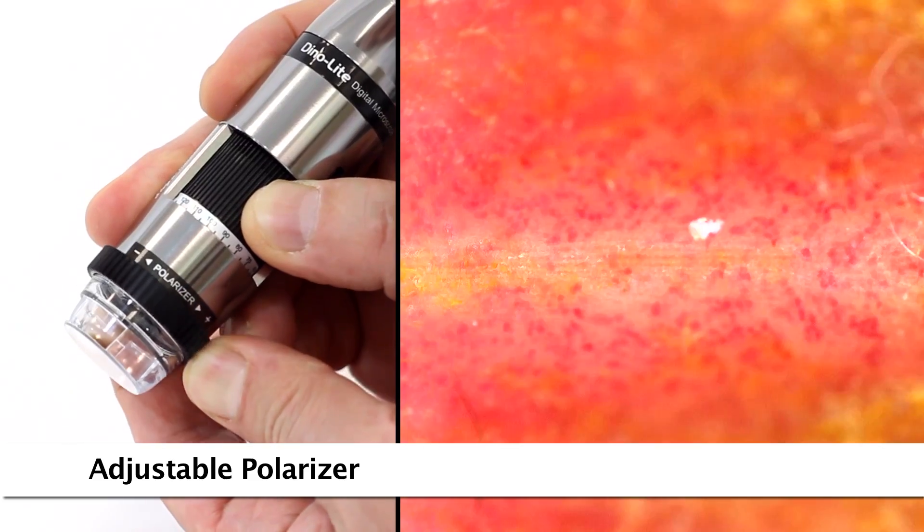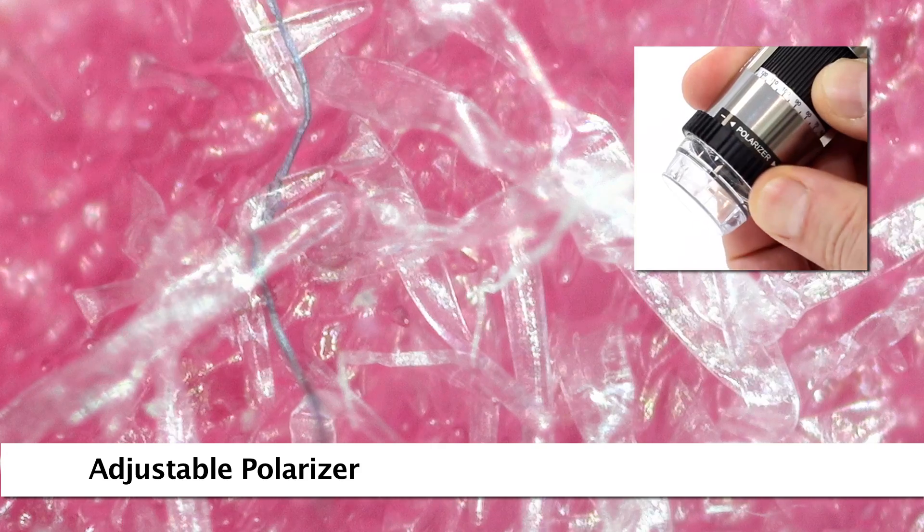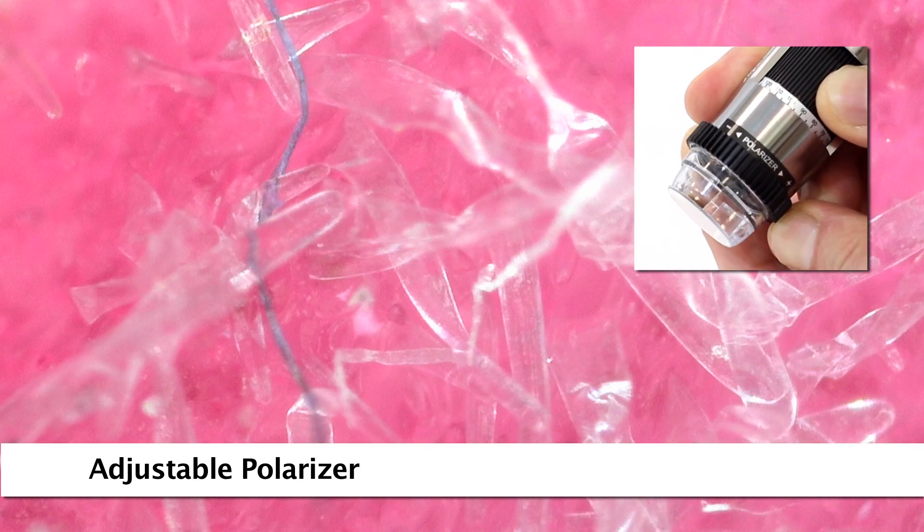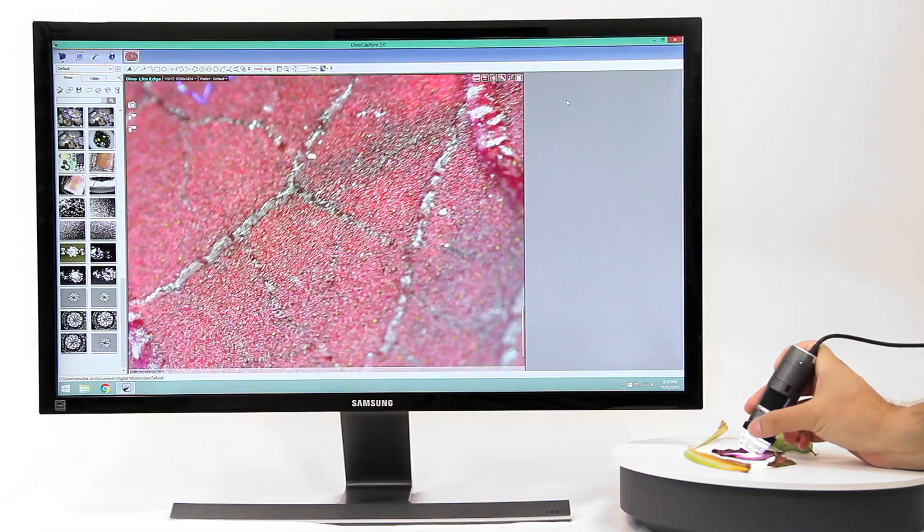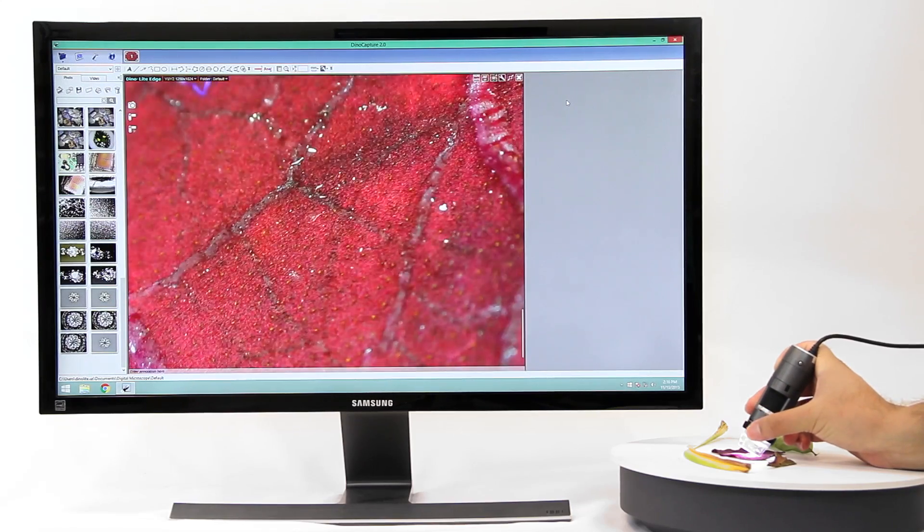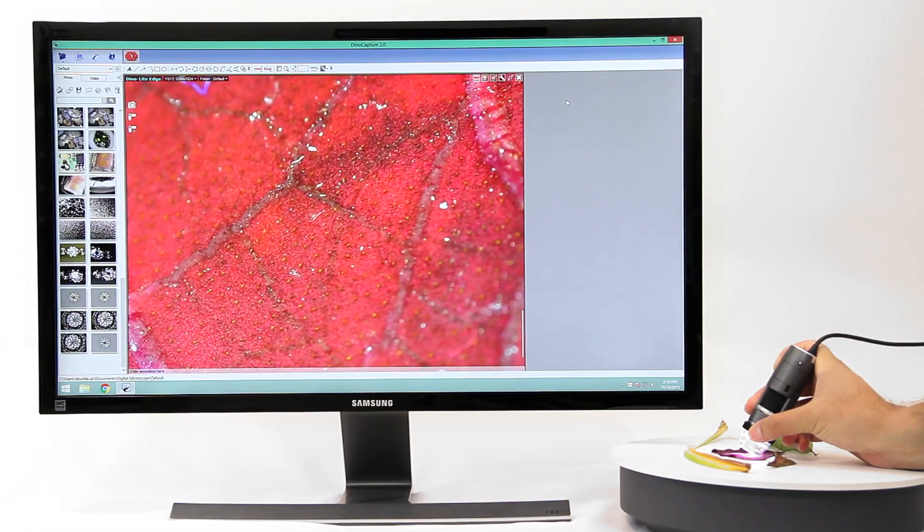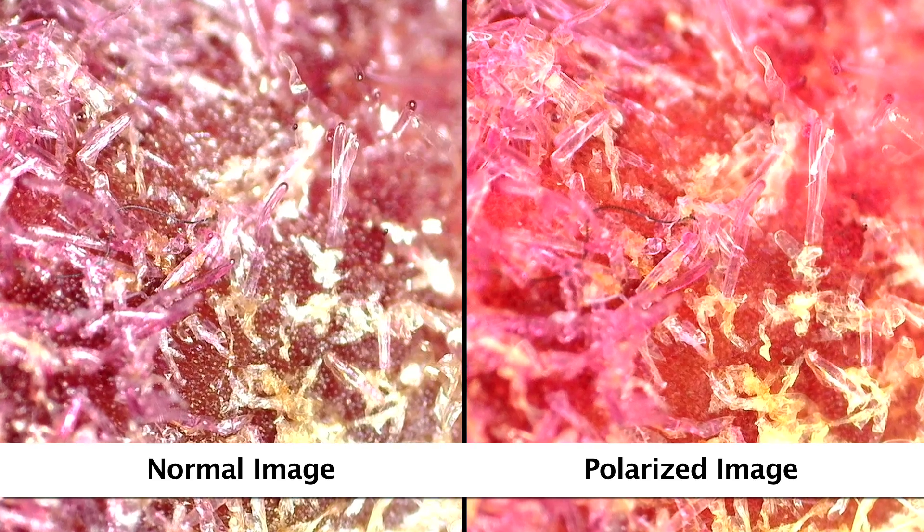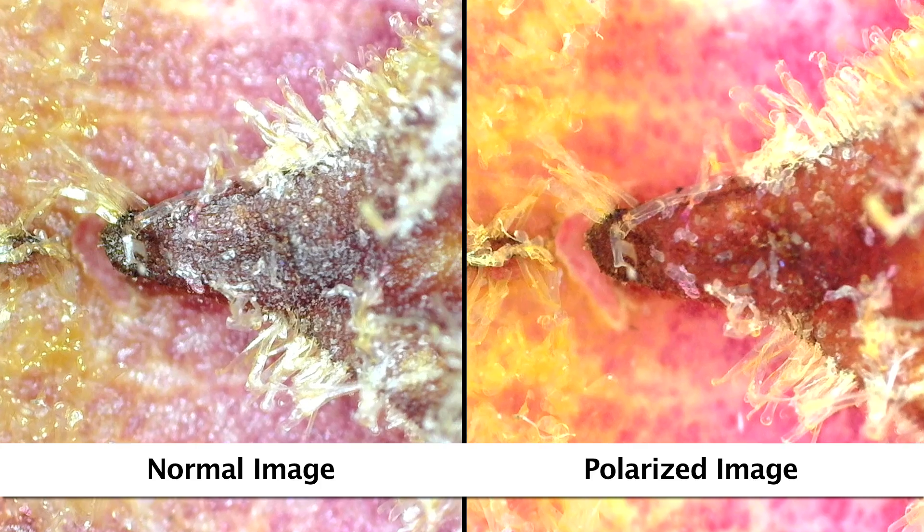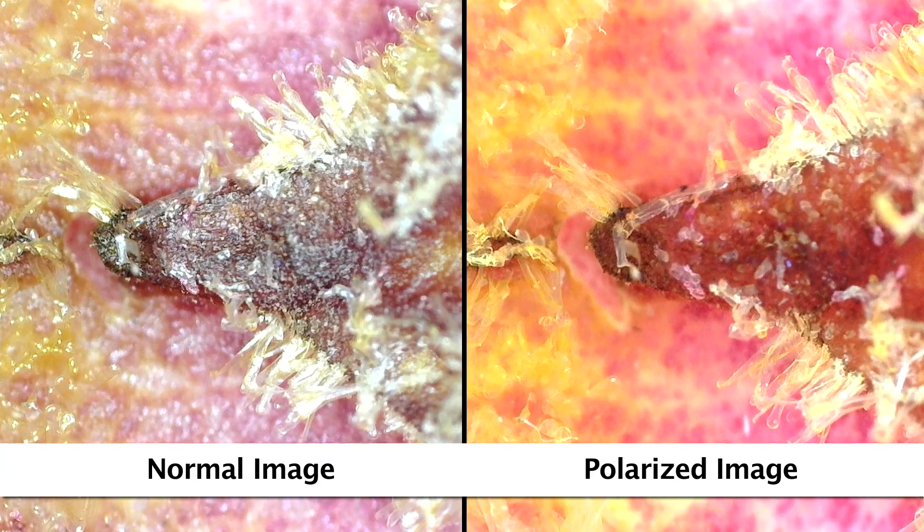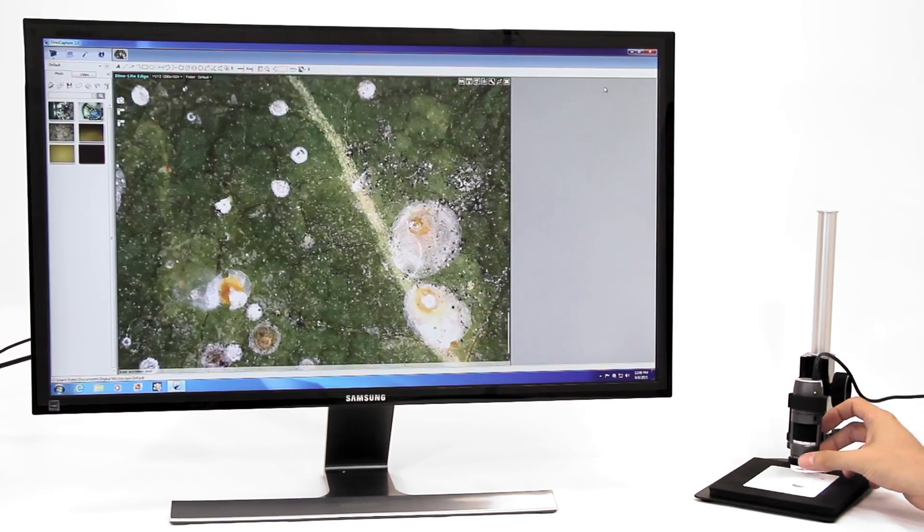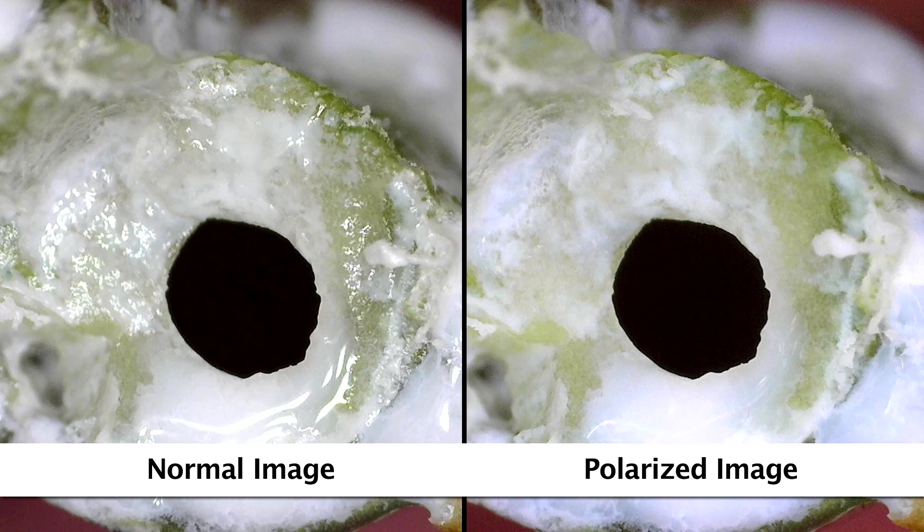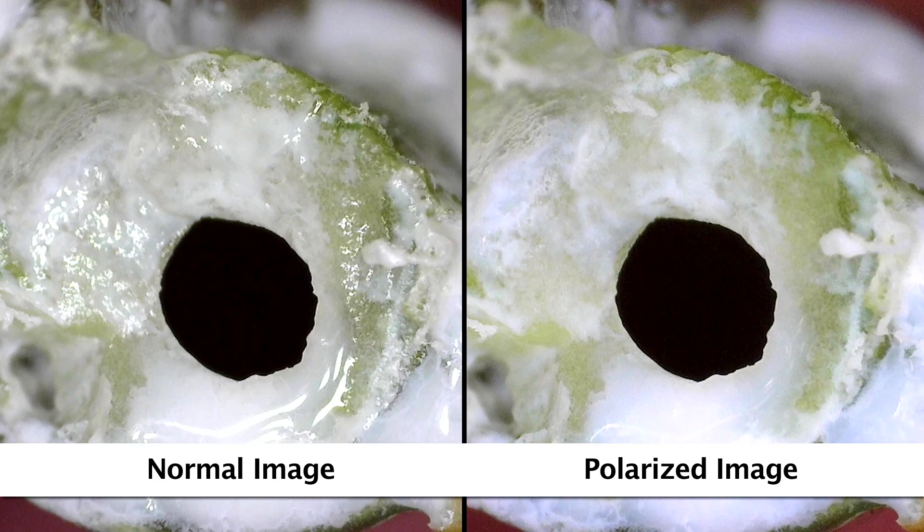Some models have a built-in polarizer that helps provide greater clarity and different features and results in imaging. The polarizer is manually adjusted and can be set from non-polarized, fully polarized, and any partial amount in between.